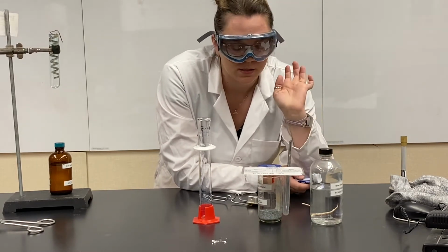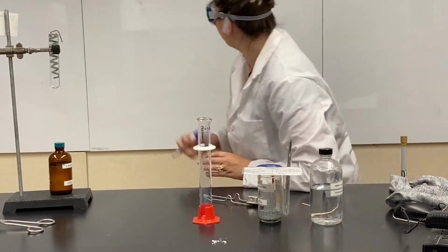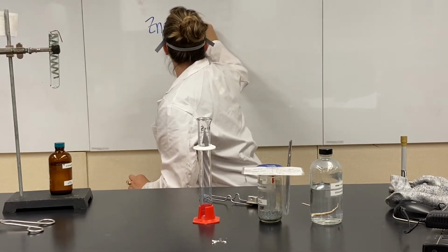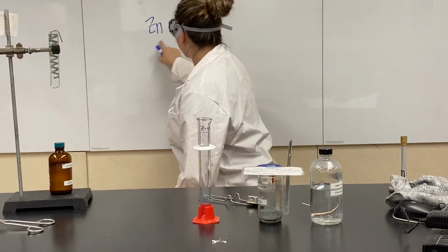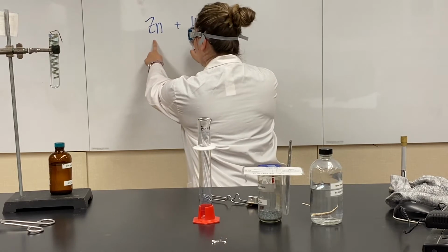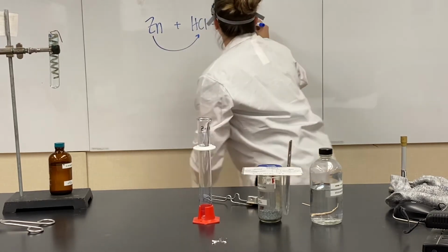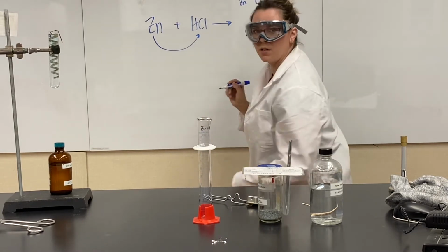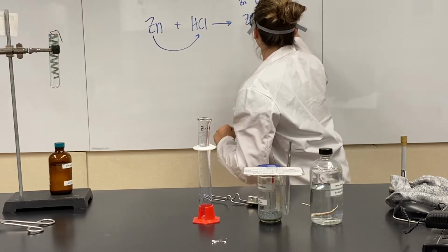And to understand what's going to happen here, we'll look at the actual reaction, okay? Crouch down here. So zinc plus hydrochloric acid. I have a single and a couple, all right? Got a home wrecker and a couple. So the zinc's gonna swoop in, kick hydrogen out of the way. So now I have zinc with a 2+ charge bonding with chlorine with a 1-. So this will be ZnCl2.